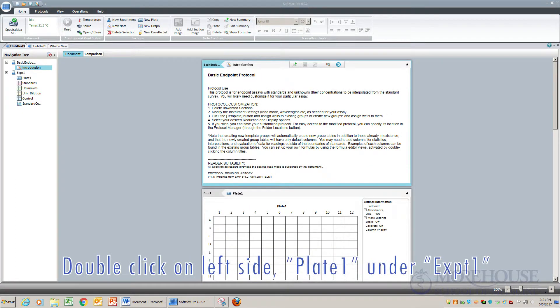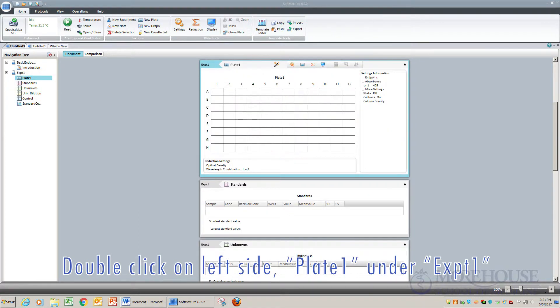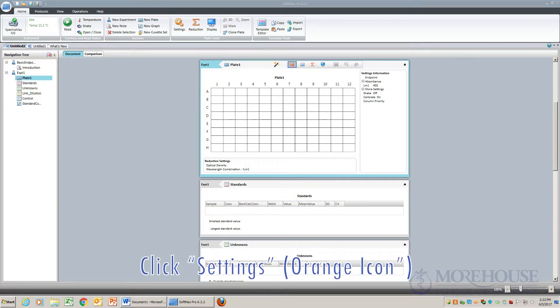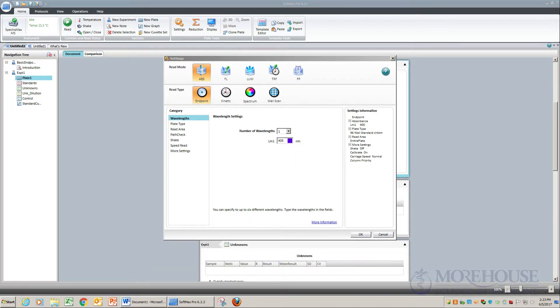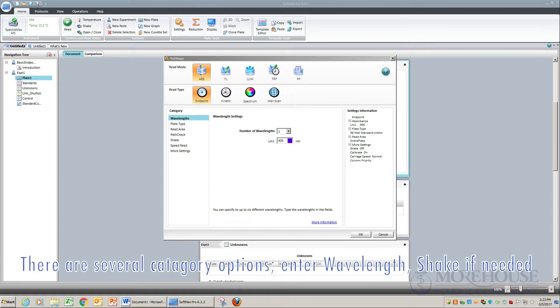Double-click on the left side — Plate 1 under Experiment 1. Click the Settings orange icon and choose Absorbance plus Endpoint. There are several options under Category. Enter the wavelength and shake if needed.